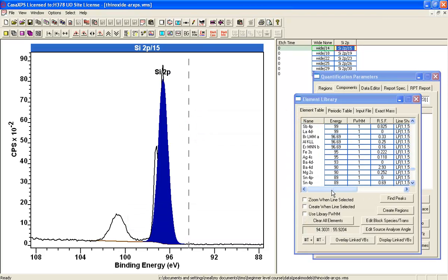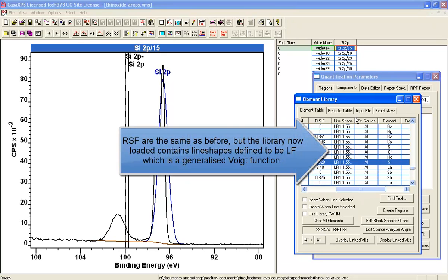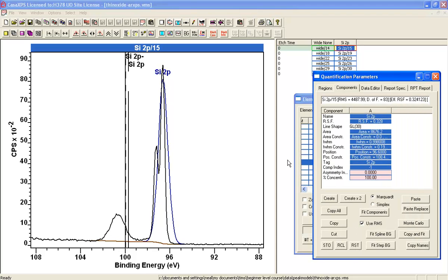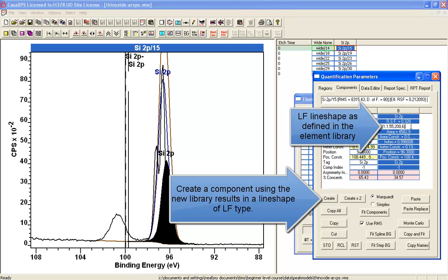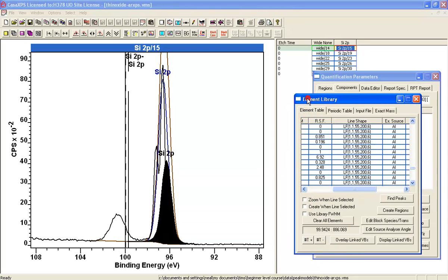So now the library looks the same, we've got RSFs that are the same, but this time the line shape is a very specific line shape which is a Voigt function that is calculated from a Lorentzian convoluted with a Gaussian with various adjustments to assist in fitting the data. So now if I create a line shape, the line shape comes in with the new line shape value that was in the newly loaded library.